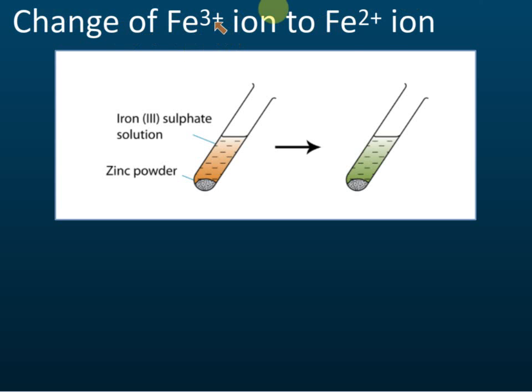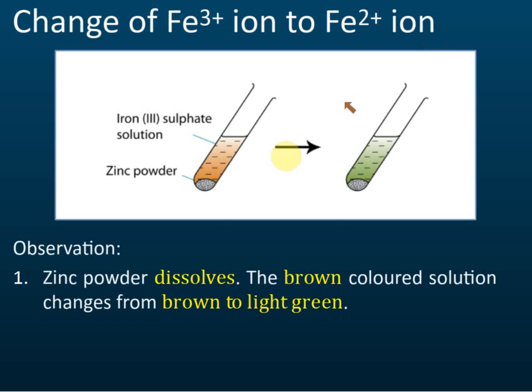Now this is iron 3 to iron 2 reduction. The color change is from brown to green — brown color to green color. This time we use zinc powder as the reducing agent. Observations: we can see that the zinc powder dissolves in the solution, and the brown color of the solution turns green. Brown color is iron 3 ion; green is iron 2 ion.